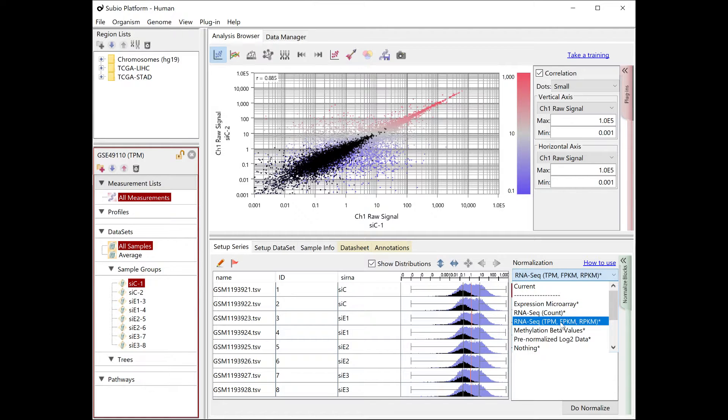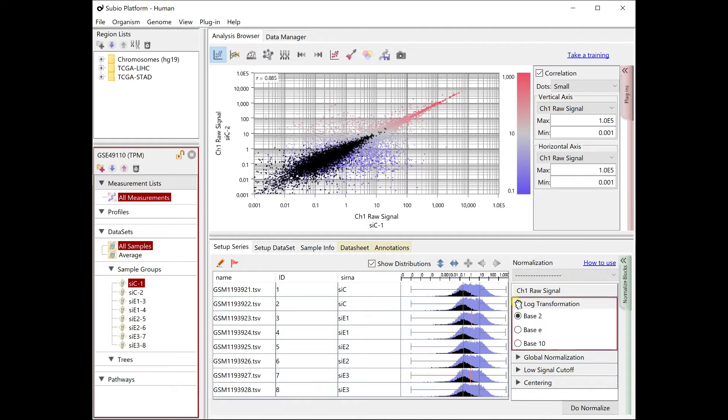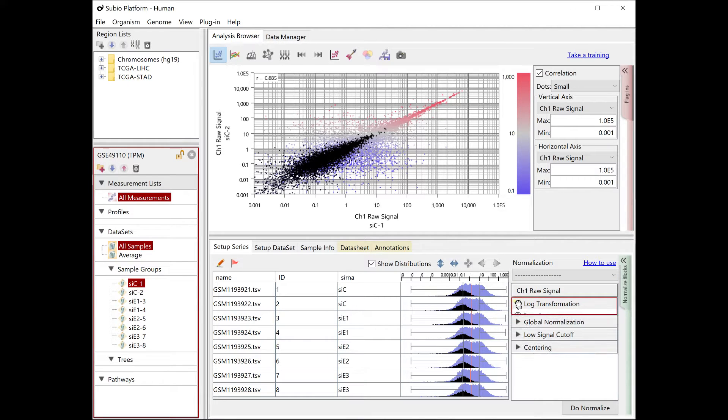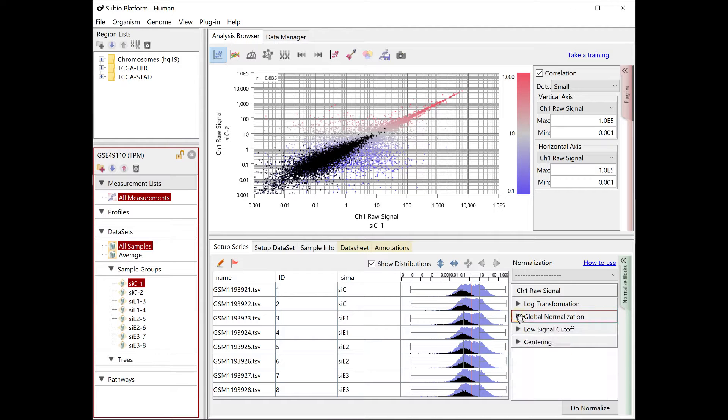Subio platform offers a preset scenario for TPM, FPKM, RPKM data. The default settings should be adjusted as you look at the data.